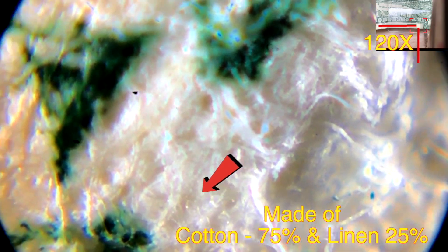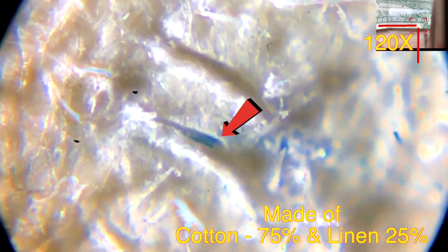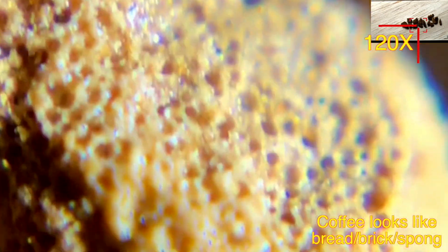Checking a dollar bill under the microscope — you can see it is basically made of 75% cotton and 25% linen. You can pretty much see that under the microscope, and that's how you can detect a fake or counterfeit bill as well.